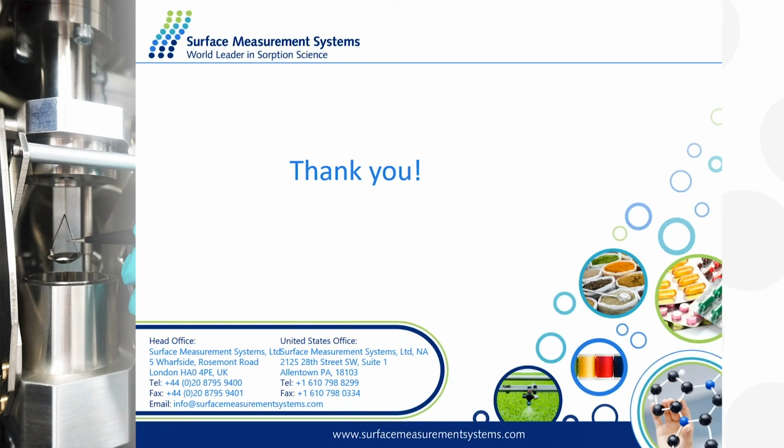For the DVS, we also use around 10 milligrams. However, if we have a sample which is more hydrophobic, we may want to increase the mass. And if we have a relatively higher uptake and equilibrium is not reached very well, then we might want to lower the mass. So it's sample dependent, but it's between 10 and 100 milligrams.